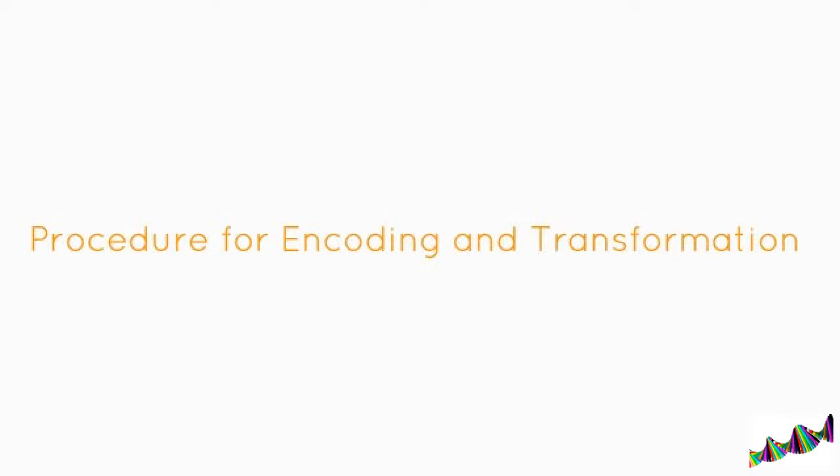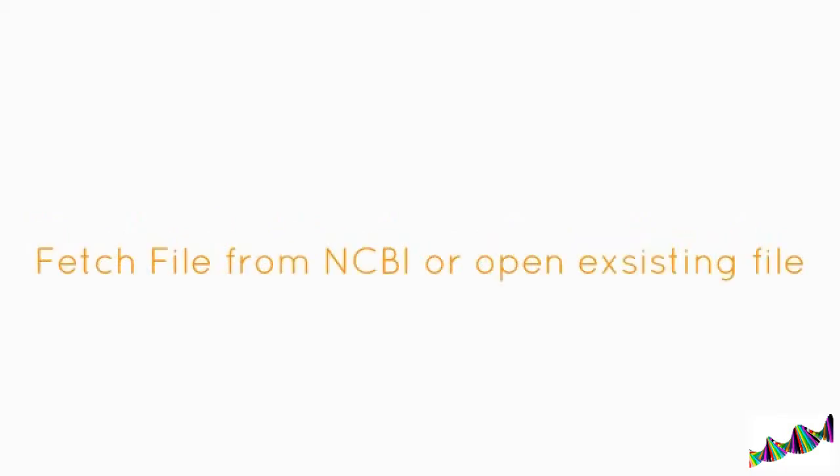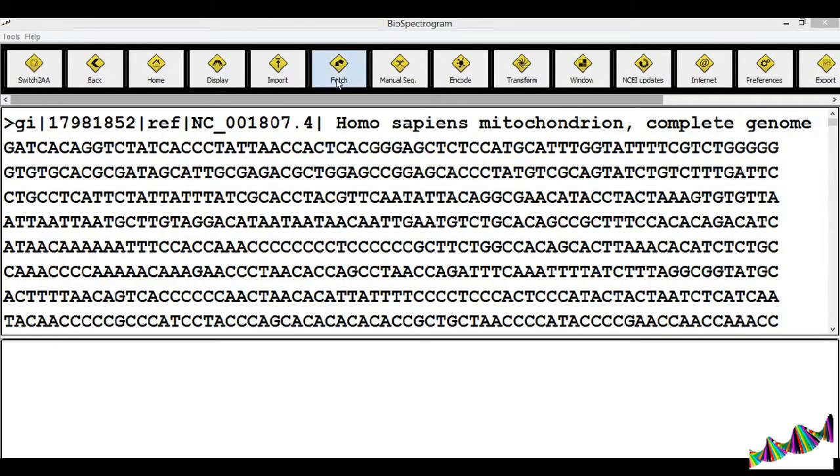Welcome to Biospectrogram. This tutorial is on how to encode and transform sequences.